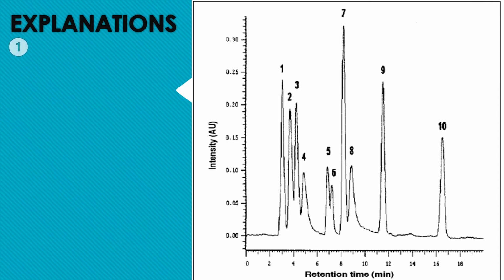The first compound to be eluted is 3,4-dihydroxymandelic acid or DOMA. This is because this compound has the highest polarity compared to the other compounds, since there are about 3 hydroxyl groups attached to it as well as the carboxyl group, which make this compound more polar. Many hydrogen bonds can be formed from these functional groups, and this causes DOMA to have strong interaction with the mobile phase, which is methanol. Therefore, DOMA is eluted first.